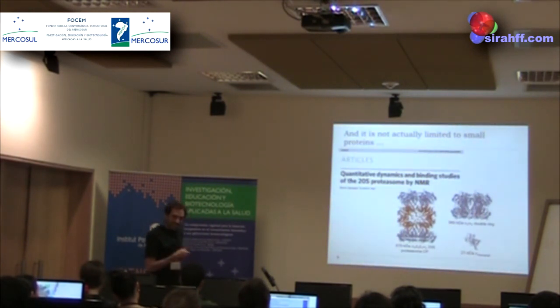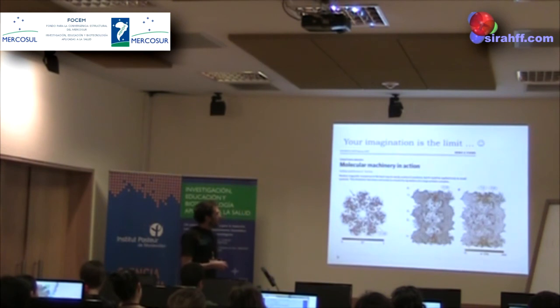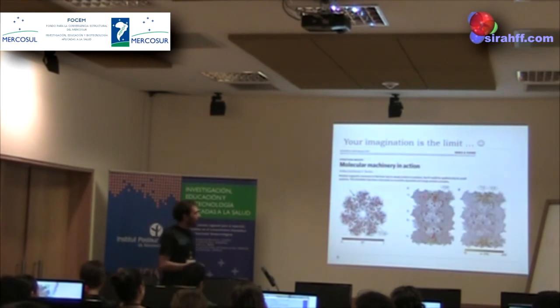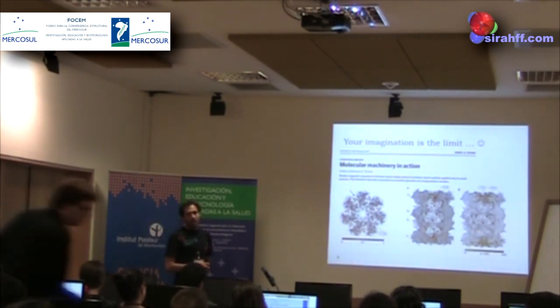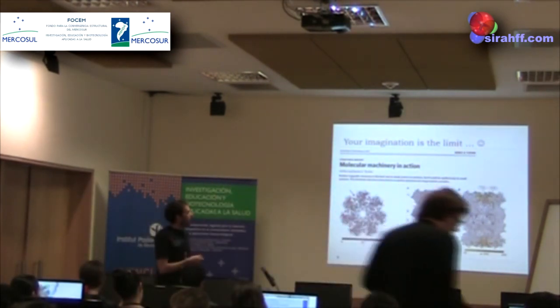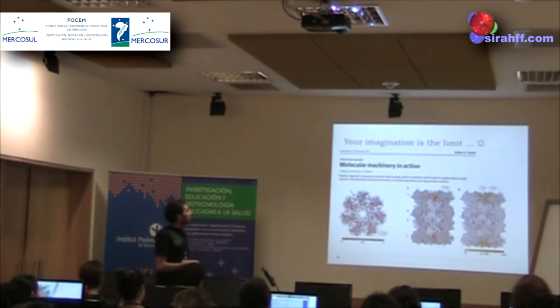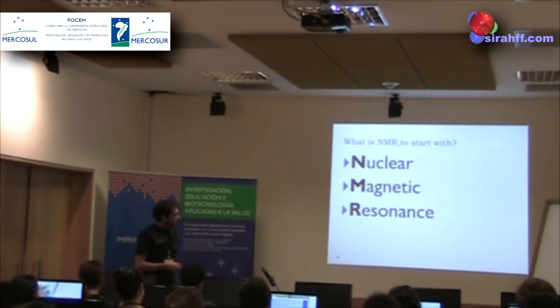It's not easy to work with, right? But it takes some money, it needs fancy labeling techniques. But as long as you have the money and the idea, you can do whatever you want in terms of system size.